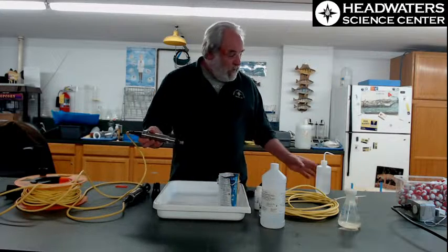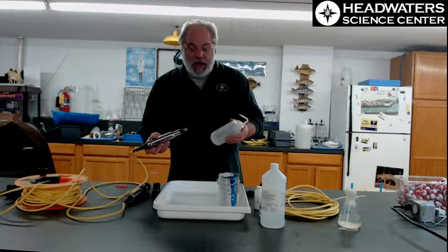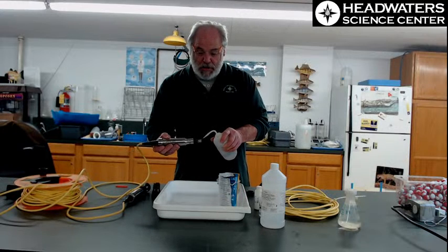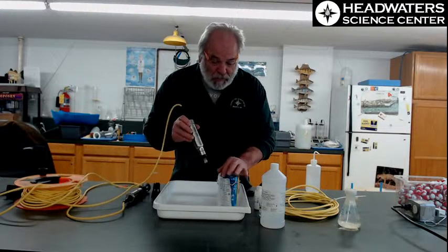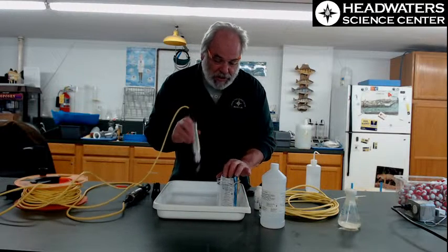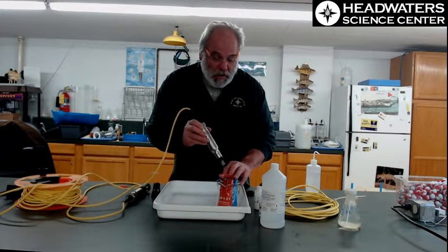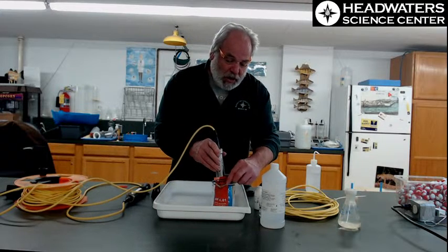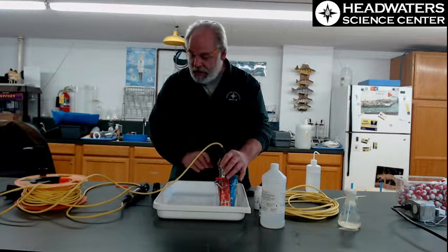So what I've sprayed on there is deionized water. This is pure H2O. It has a neutral pH. It has nothing really on it except pure molecules of hydrogen and oxygen. So I always start, I'm going to turn it this way so you guys can see that, with the 4.0, and that's the low end of the pH. That's very acidic, and I put that in there.